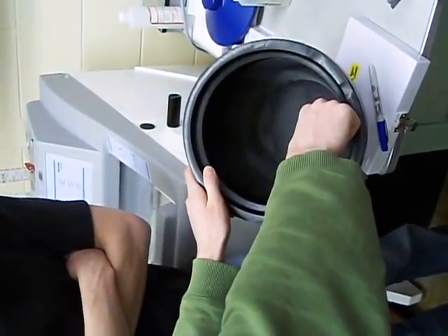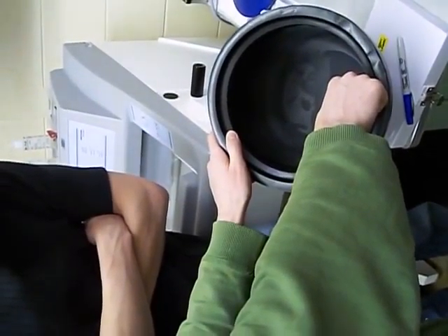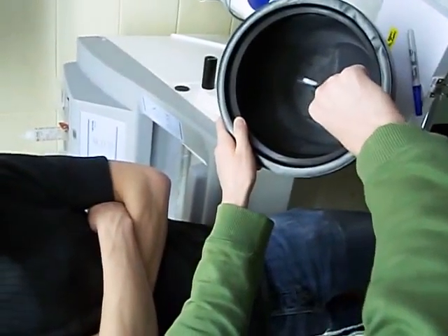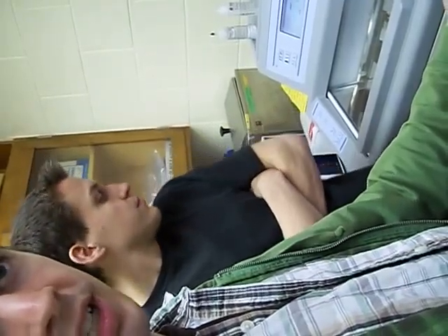Okay, so here we go to freeze it. One, two, three, four, five, six, seven. After the seven seconds, you want to pull it out of the liquid nitrogen and let it sit so the temperature can kind of equilibrate.